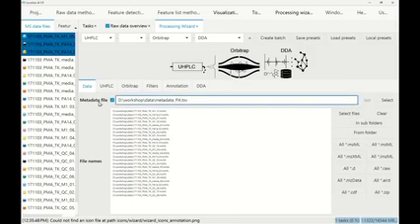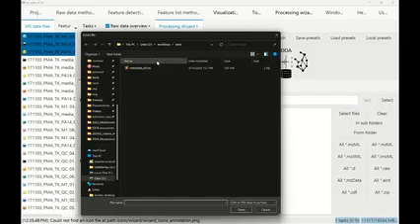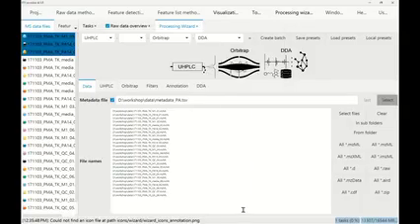Then there's the metadata file, and this is only important if you want to do statistical analysis here. So you can just click on select, and also in the data folder we shared the metadata_pa.tsv. This file just contains some information about the samples and which conditions they were acquired for. It was microbial strains, so different mutant strains and wild type, and then controls and blanks.